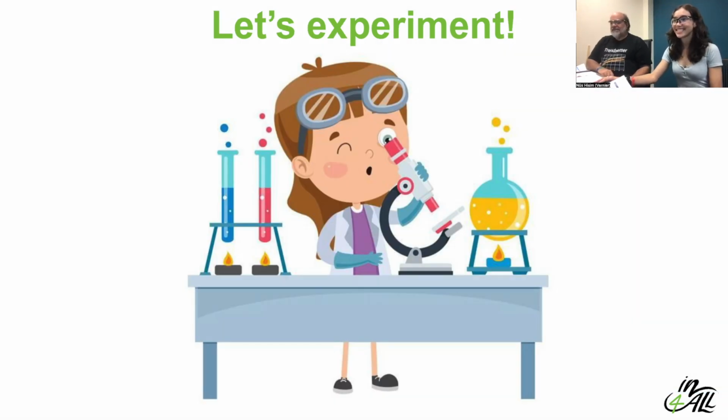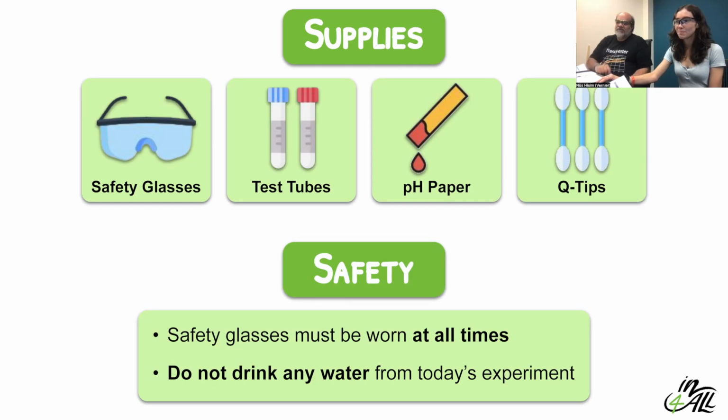All right, let's experiment. I'm not too fanatical about those goggles not being on the eyes, but looking through a microscope is very difficult with goggles. So I understand that. Okay, let's go ahead.